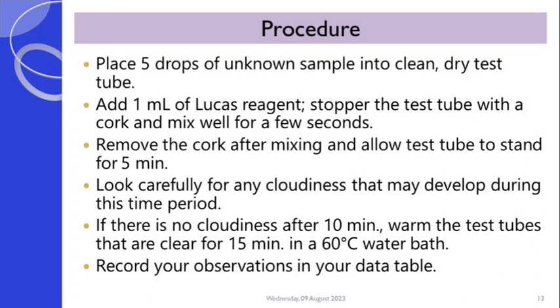We are advising that after 10 minutes, if there is no sign of cloudiness, you may want to warm the test tube for about 15 minutes. This is done in a water bath. You would then record whatever you see in your data table that you have prepared nicely.